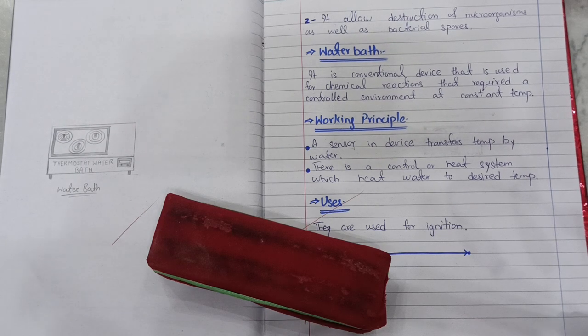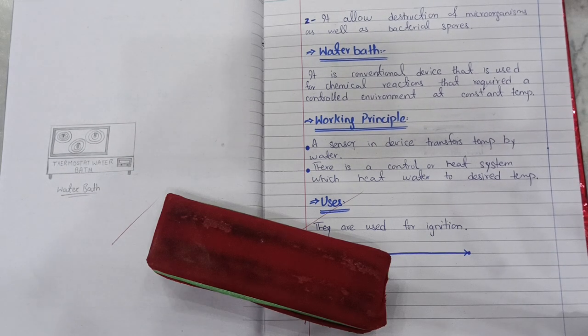There is a control and heat system which heats the water to the desired temperature. तो वो एक कंट्रोल सिस्टम इसके अंदर प्रेजेंट होता है जो टेम्परेचर को कांस्टेंट ही रखता है. अगर 60 डिग्री टेम्परेचर चाहिए तो वो उसको कांस्टेंट ही रखेगा.